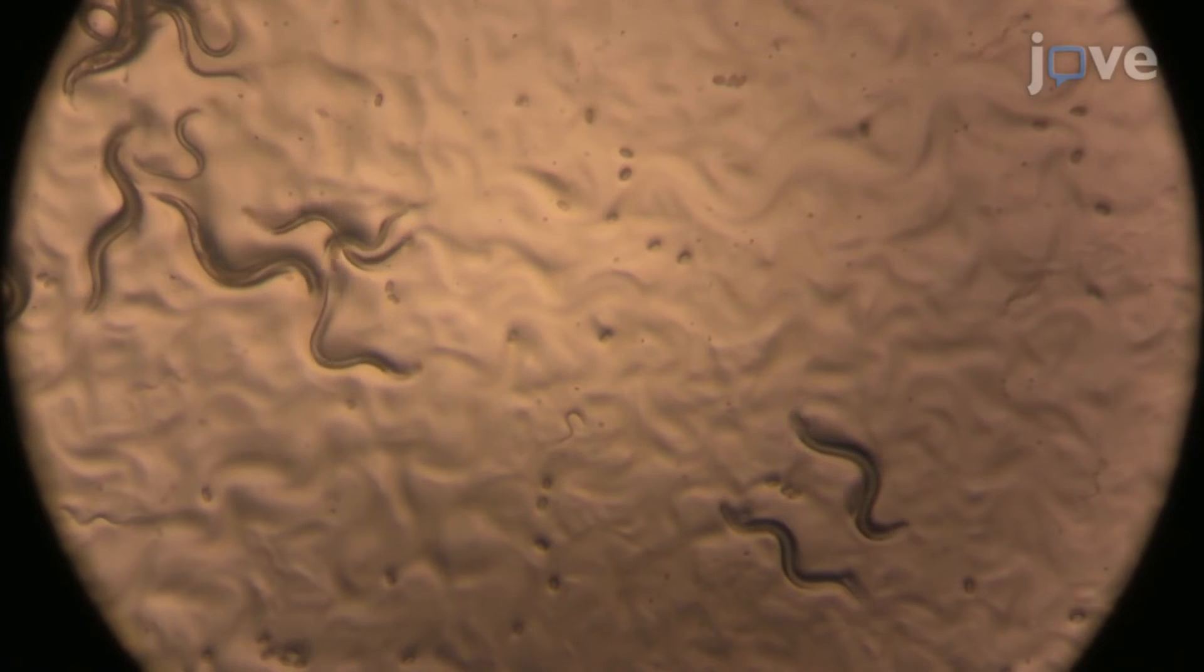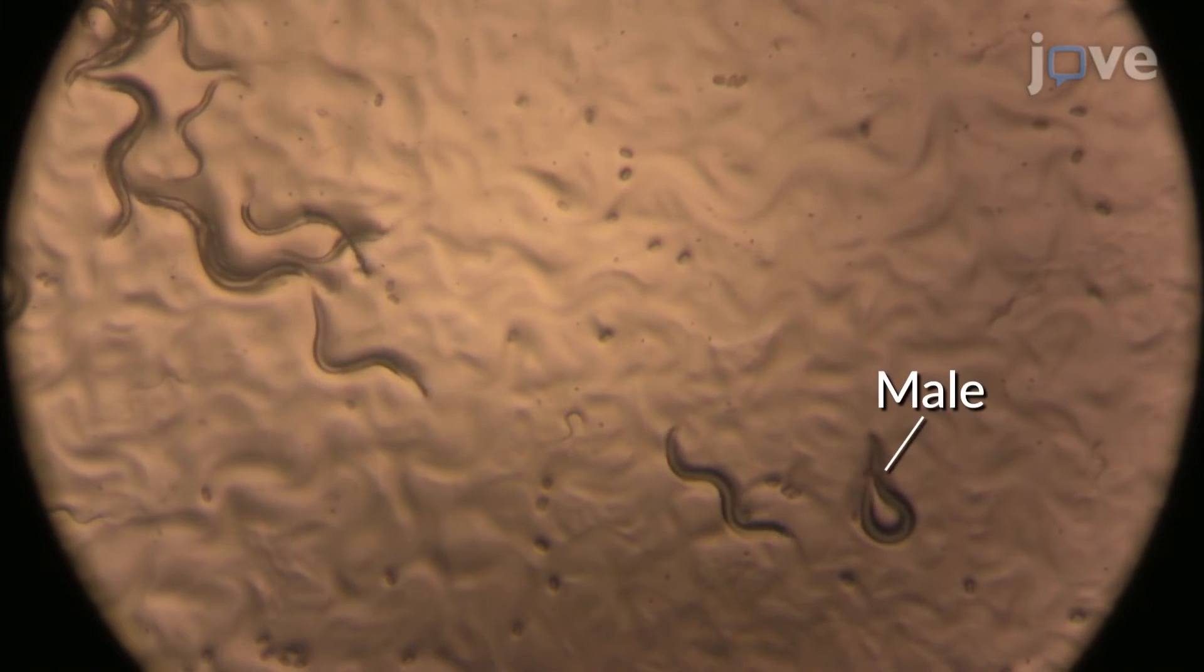Under a microscope, on a plate containing 1 to 3 day old adult C. elegans, identify the males by their fan-shaped tail.